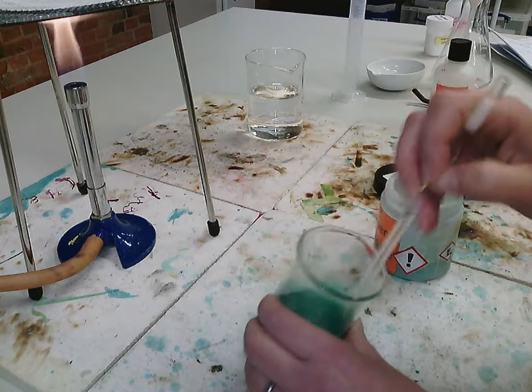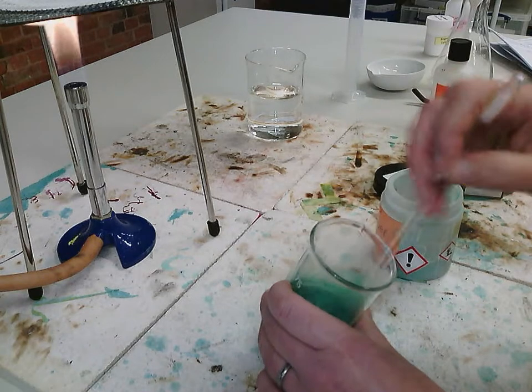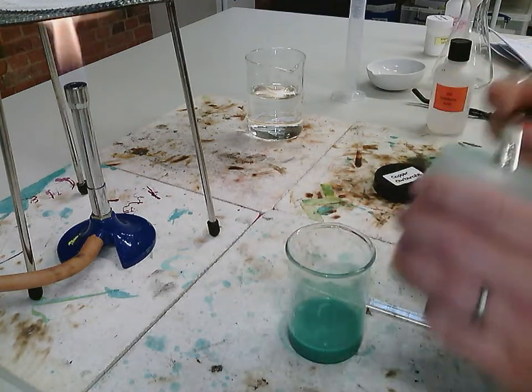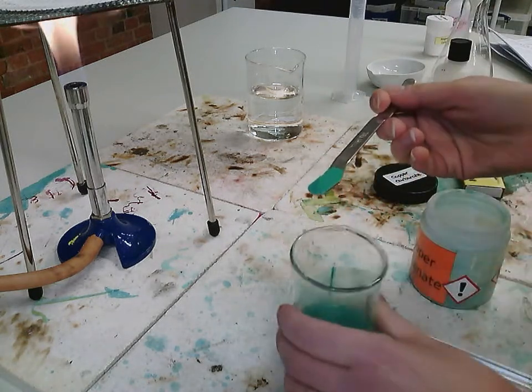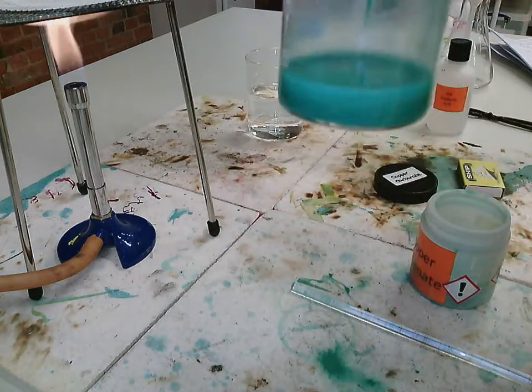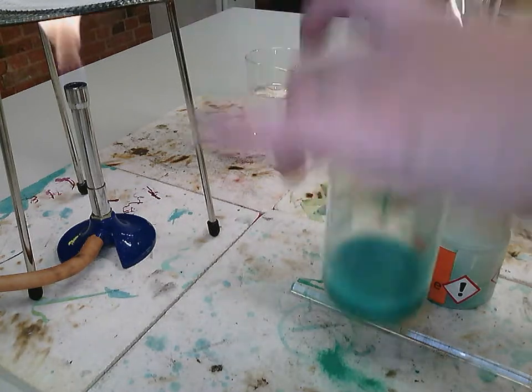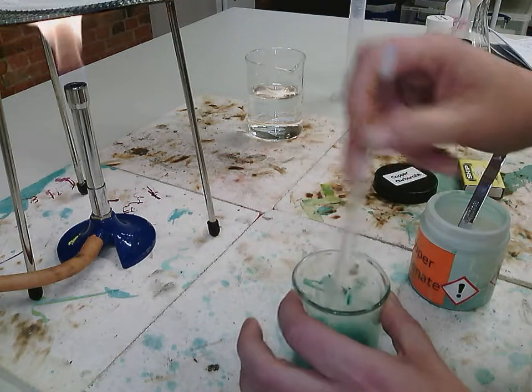We'll keep doing this until there's no more sulfuric acid left. So you can see as I'm adding it now, nothing's happening. So adding it. There's no bubbles, there's just big ones from this. So that is fully reacted.